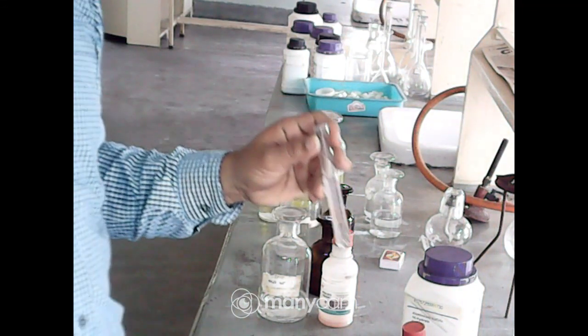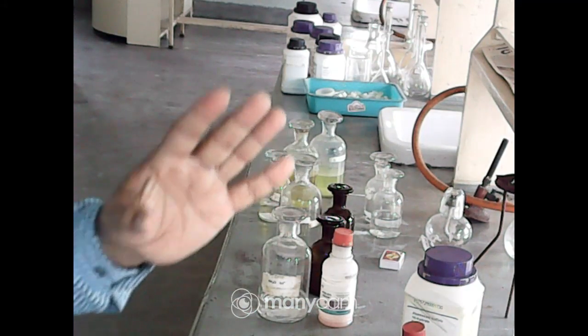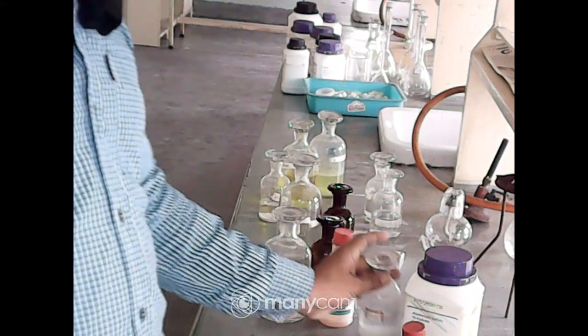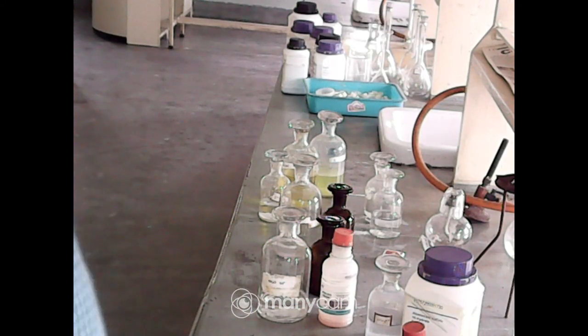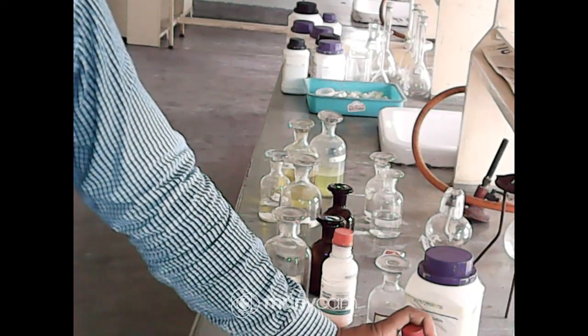So what we have done, first make OS, then add NH4Cl, then NH4OH, the PPT will come which will float. But this is not the proof that it is only for aluminium. Then dissolve the PPT in HCl. After that add blue litmus, then again add NH4OH. When you add dilute HCl, the PPT will dissolve. And when you add NH4OH again, the PPT will reappear, changing the color of the solution.